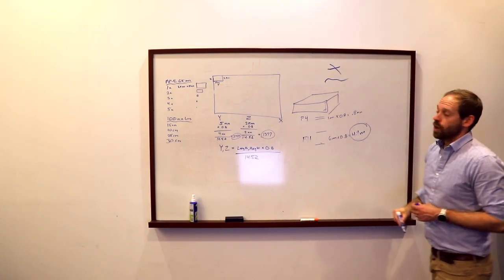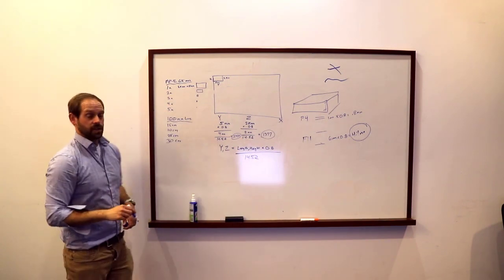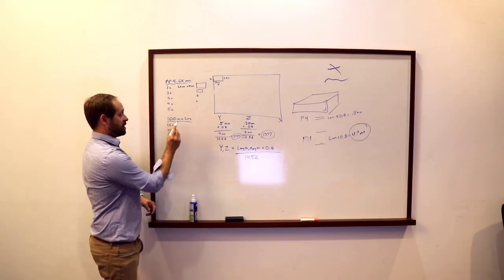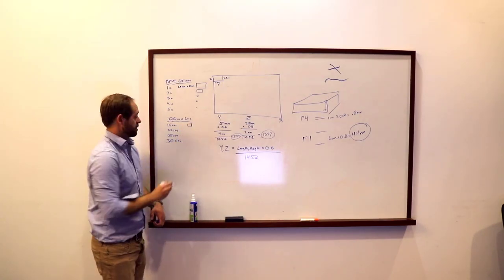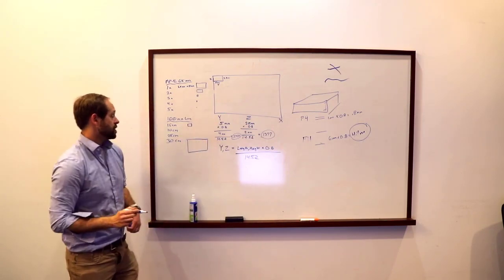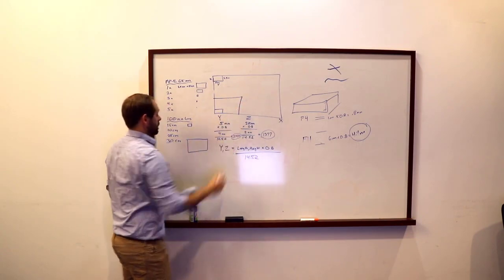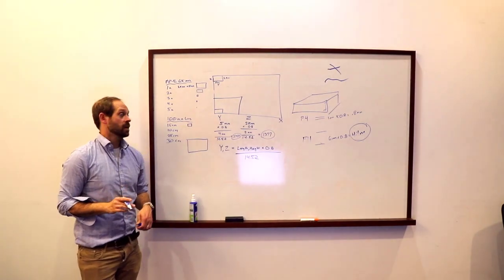So this is the number you can actually enter for your x-axis. Okay, the last thing to review is that your MP65 works by magnification. Your 100 millimeter does not work by magnification. It works by distance from your sample. So 15 centimeters away from your sample, you're going to be much, much closer. 30 centimeters away from your sample, you're going to be much further away, so you're going to get a lot more field of view into each image. So at 15, you might only be seeing a small part. At 30 centimeters away, you might be seeing a very large part. So your numbers are going to fundamentally change.